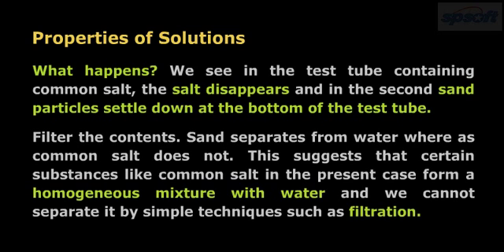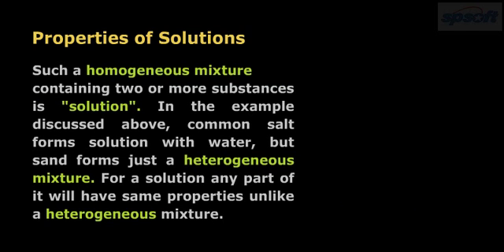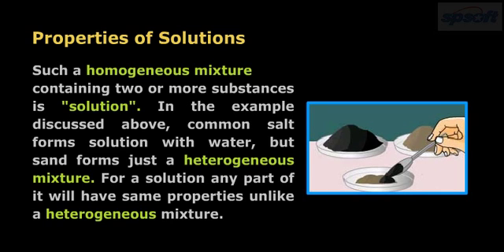Filter the contents. Sand separates from water, whereas common salt does not. This suggests that certain substances, like common salt in the present case, form a homogeneous mixture with water, and we cannot separate it by simple techniques such as filtration. Such a homogeneous mixture containing 2 or more substances is a solution.